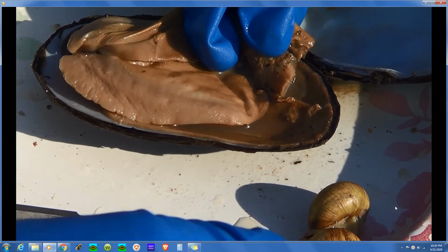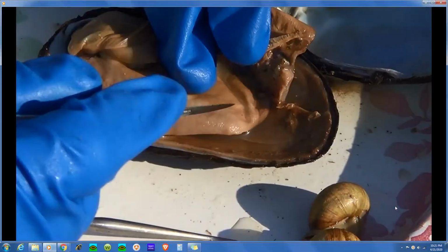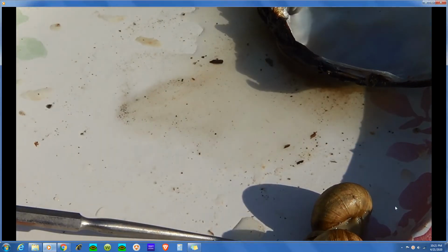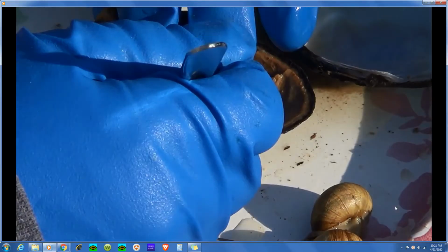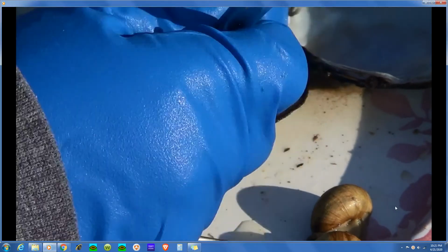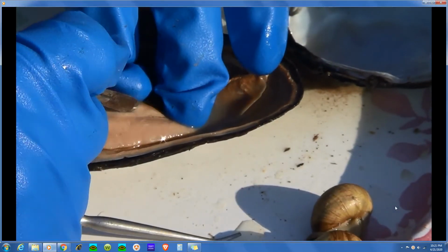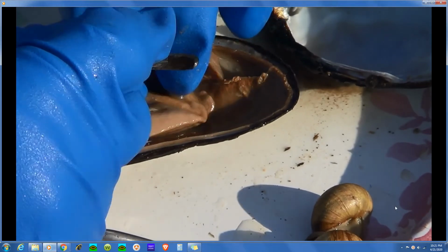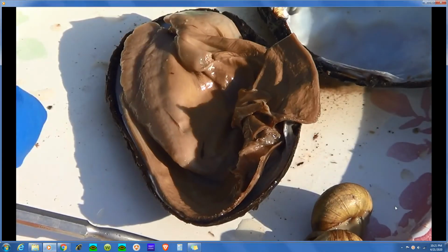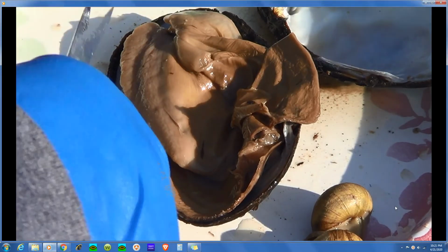Ours is closed. Now I'm going to take the scalpel here, and I've still got a lot of fluid. I'm going to take my scalpel and make a little incision here. Boy, I should have gotten a better scalpel blade. This is terrible. I got a little opening started, and now I'm going to switch to scissors because scissors work better. With scissors, you don't accidentally cut what's underneath.